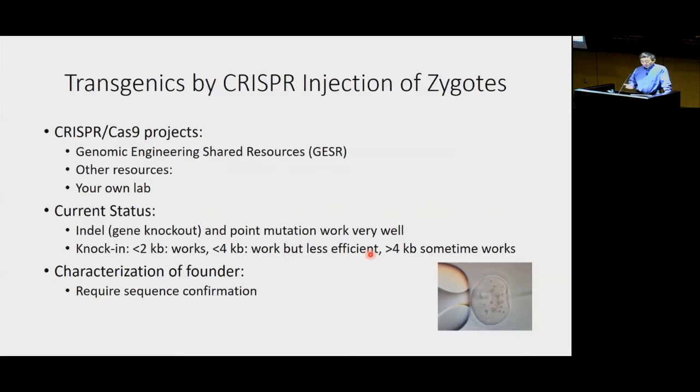I'm not sure exactly what the problem is, but when other transgenic facilities want to do a similar project, sometimes it works, sometimes not. So it's not, as the papers claim, that efficient, not 100% or whatever. Hopefully people here can understand that.